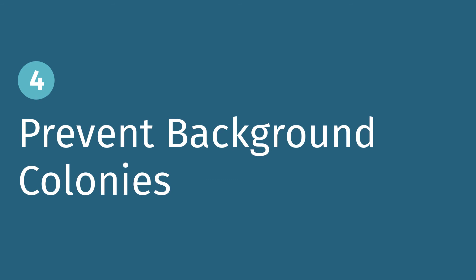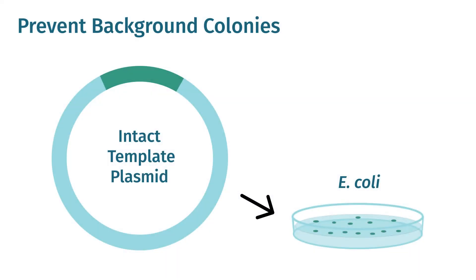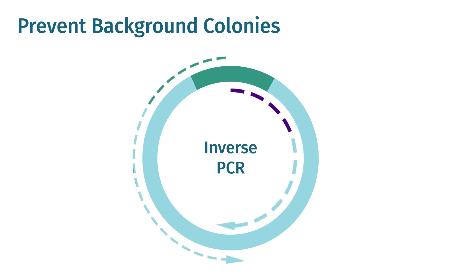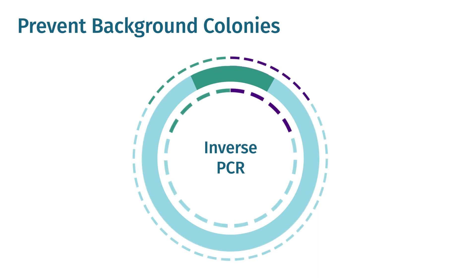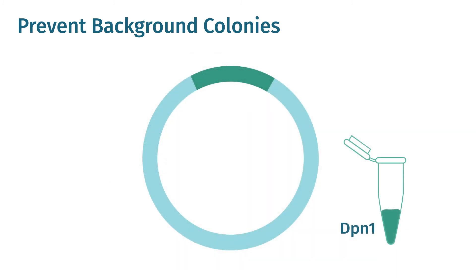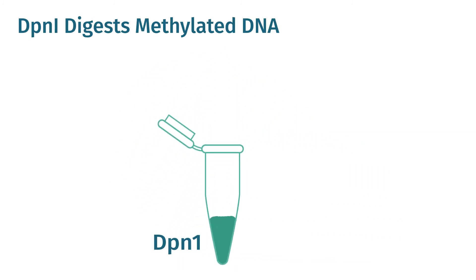Tip four: prevent or select against background colonies. PCR fragments created for Gibson assembly may use a template plasmid. If the template plasmid is carried through the reaction, it can result in background colonies. Preventing background colony growth is particularly important if you have chosen to use inverse PCR to prepare your cloning vector. You can prevent this in one of two ways: either by gel purifying your PCR product band, or by adding DPN1 to your complete PCR reactions.